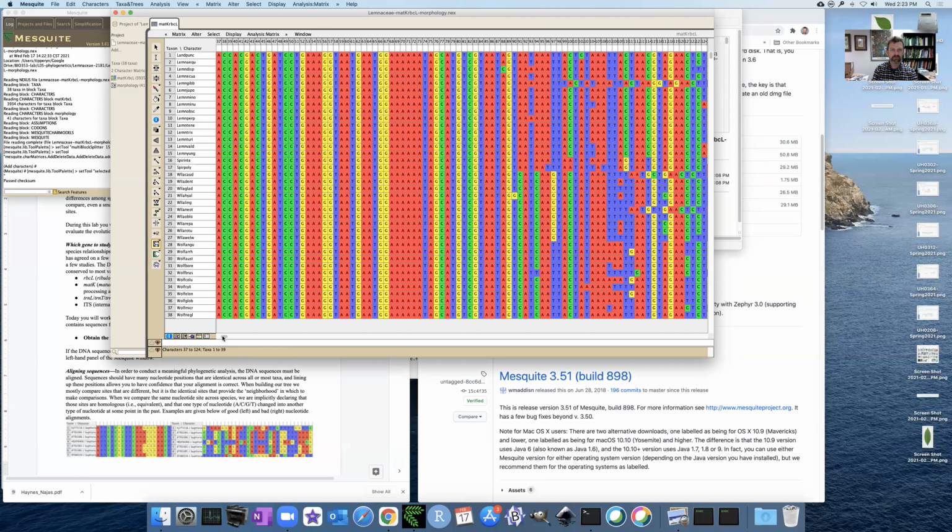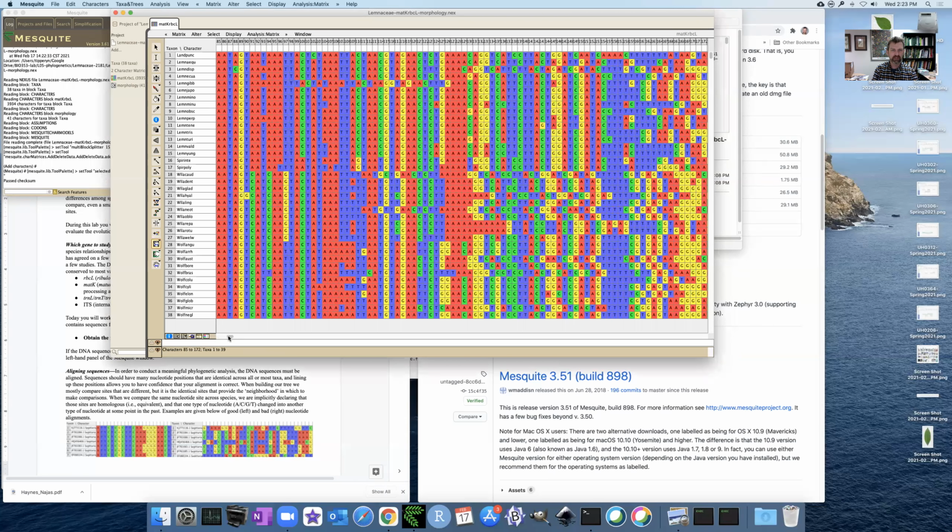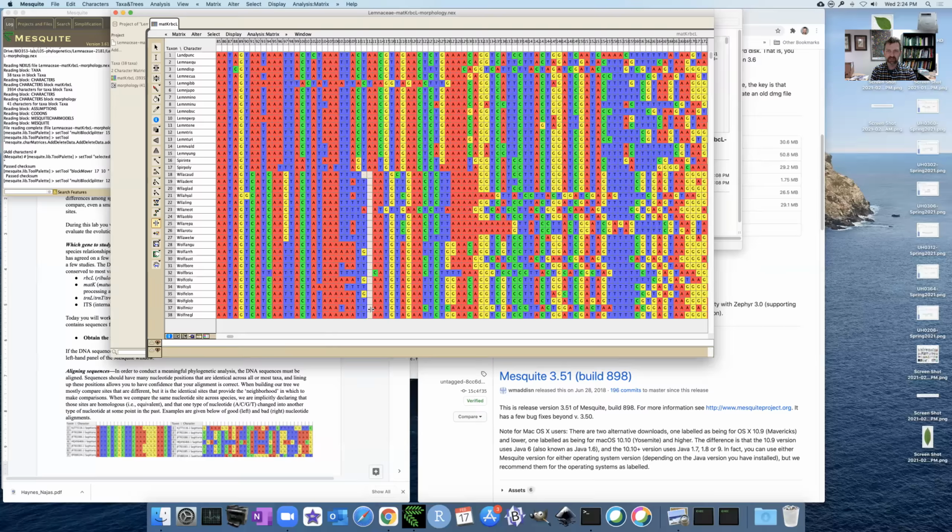And we can see going through lots of similarity, some interesting differences. And usually it's not too far until you get to the point where it's probably not as effective to do this manually. I've certainly done a lot of manual sequence alignment in my day. If you're working with lots of data, you tend to need to do this in a way that's a little bit faster.